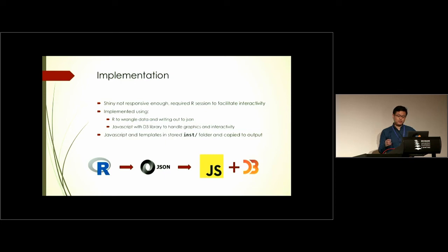Also, if you wanted to send that off to a collaborator, you'd have to make them install R and Shiny, and I think RStudio needs to be installed as well to get all of that to work. That wasn't a very portable solution, in my opinion. The other alternative is to host it on a web server so it becomes a web app, and that's a lot more stuff to manage. So we really wanted to make it so that you can just send the whole thing off without having to worry about all of that stuff.